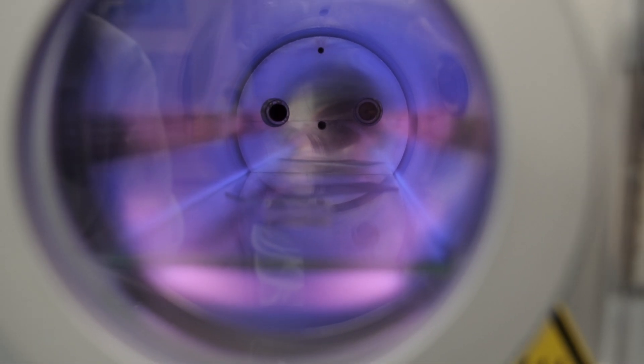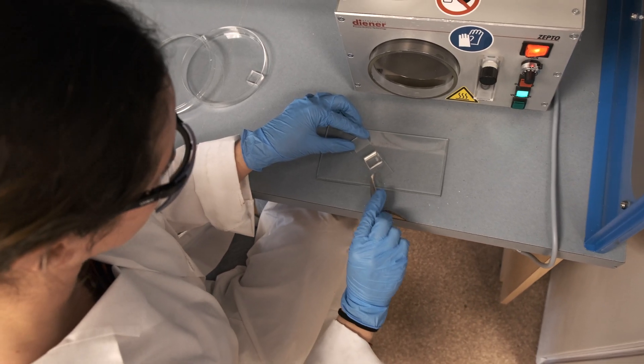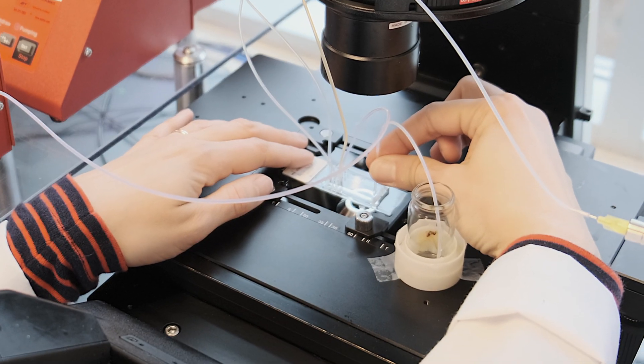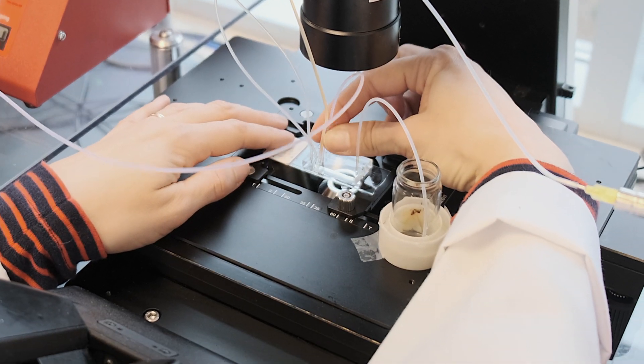When I was an undergraduate student it felt like this was the technology of the future. As you know, phones used to be these huge pieces of furniture almost that you would have in your house, and now we've got these tiny mobile phones. In the same way, now you're in a chemistry lab and you would probably use some glassware to pour some liquids together to do a reaction, but it's big volumes of liquid. Now we can do that on a chip with tiny amounts of liquids.